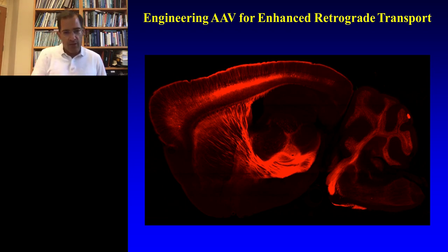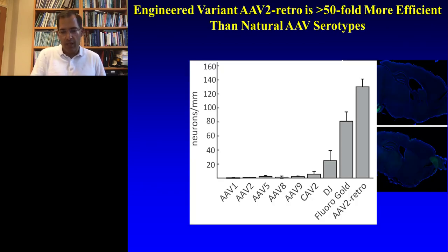We wanted to quantify the efficiency of this process. That was a cytosolically soluble version of a fluorescent protein, so to quantify, we used a nuclearly localized GFP so we can count individual cells stereologically. You can see here this is AAV2, a natural version of AAV. There's an injection in the lower left-hand corner, and you can see a cluster of green cells. However, there's nothing in the cortex, which is the long strip of tissue in the upper right-hand corner. This is an engineered version of AAV developed by another lab in the field. Injection into the pons leads to maybe a few speckles of cells in the cortex. And this is our engineered version of AAV, where with a single injection in the pons, you can see that we're spray painting the cortex with very large numbers of transduced nuclei, meaning we're getting very efficient expression.